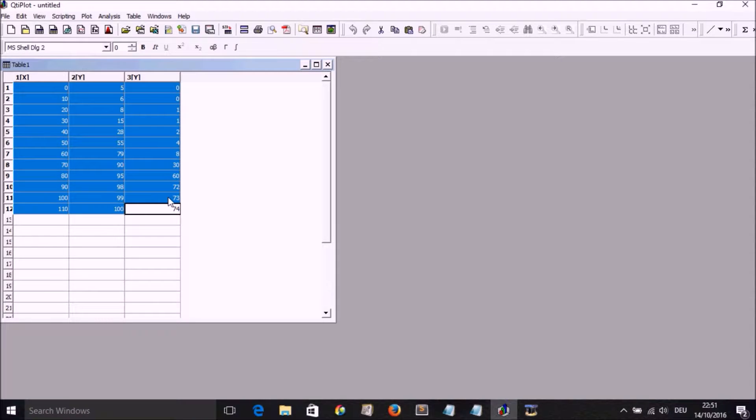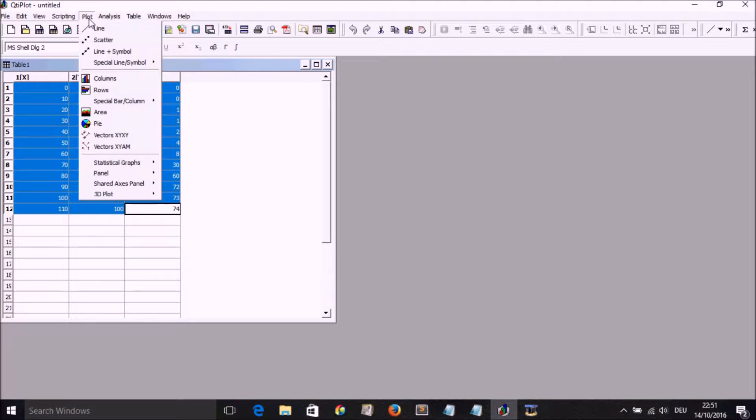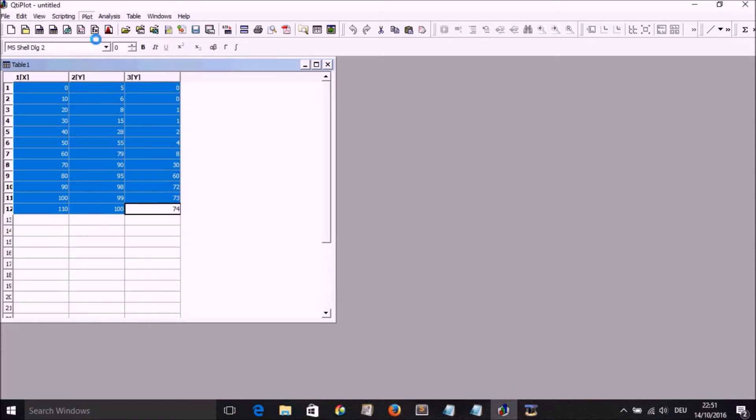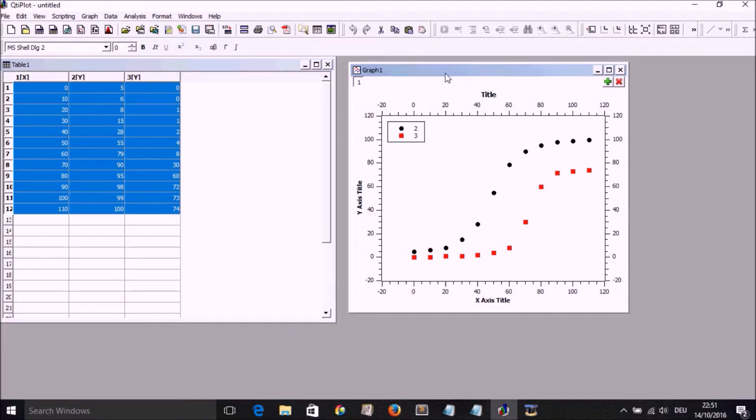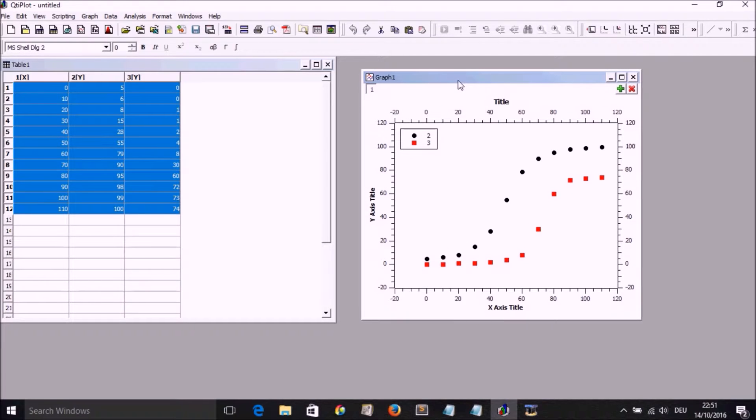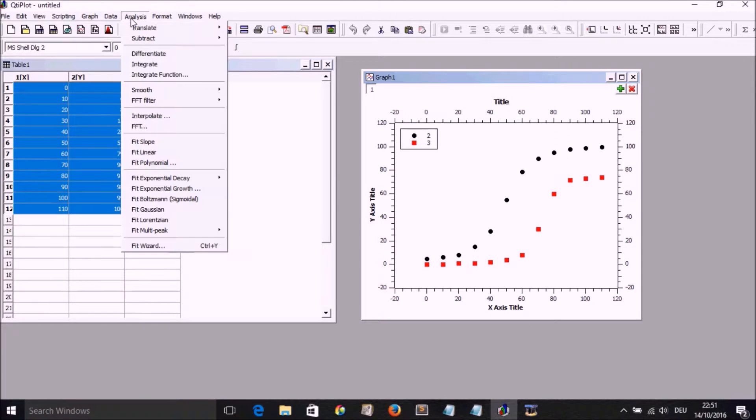And then we go plot, scatter, and we're going to have this plot showing on the Y axis the OD in percentage.